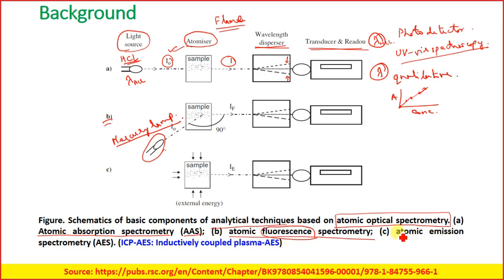Lastly, we have atomic emission spectrometry, AES. Over here, it corresponds to luminometry, which we discussed in our last class.